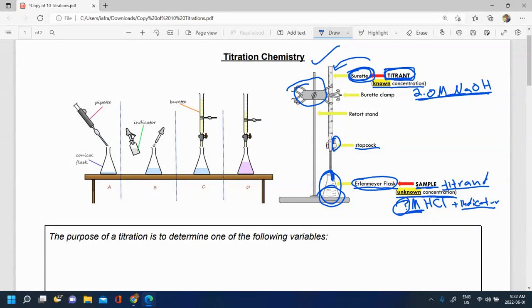So it sort of looks like this. You take some of your unknown substance using a pipette just to be very precise, put it into your flask. You then add a few drops of your indicator, two or three drops, depending on what the procedure calls for. And you won't see a color change right away. For many of them, you won't even realize it's there.